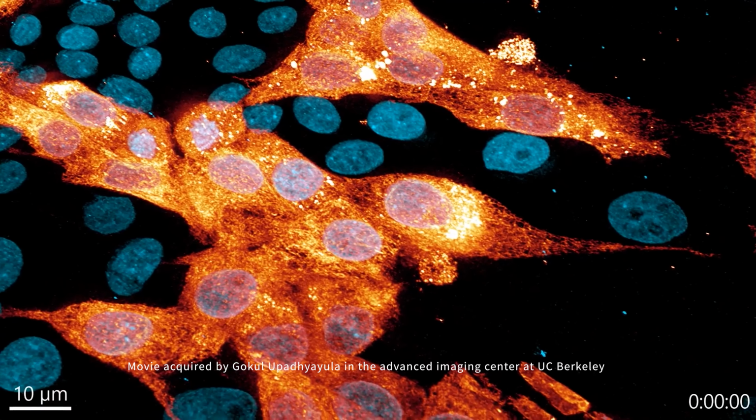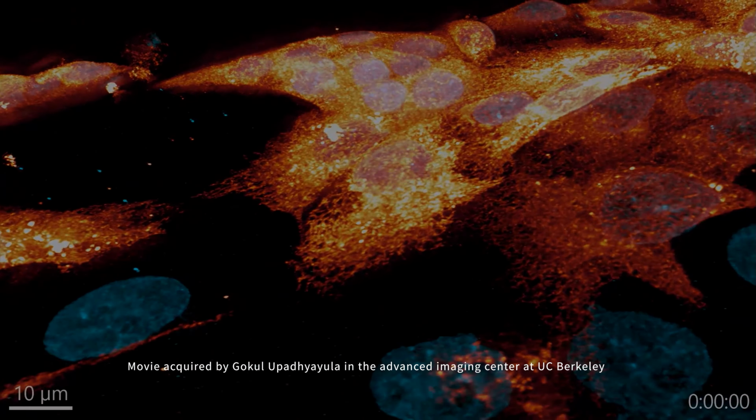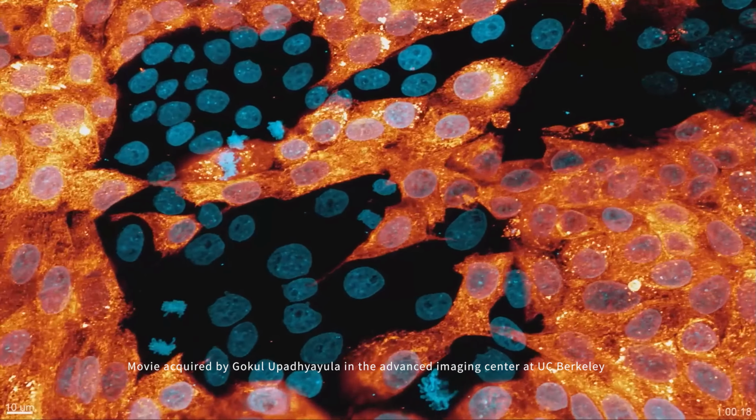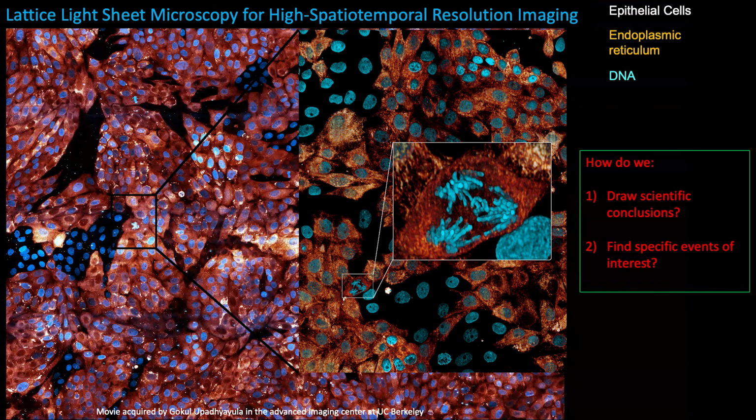Now, this becomes a limitation if we consider the amount and complexity of data that modern instruments can generate, which can be three-dimensional, it can be multicolor, and it can evolve throughout time. So this complexity poses several challenges. First, how do you quantify and test different scientific hypotheses from this vast amount of information?